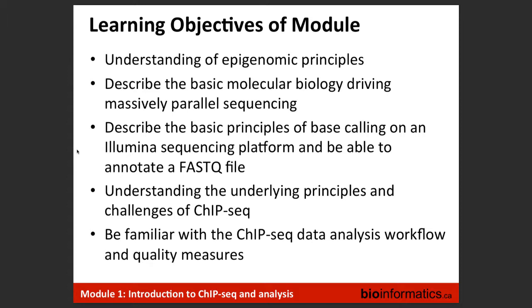But I'll be talking about that because that, of course, is the fundamental measuring technology that a wide, not all epigenomic measurements, but certainly a large fraction depend upon. The output of that is the FASTQ file, which becomes the input for all of the downstream analysis, and Misha will carry on with the description of what we do with the FASTQ file.